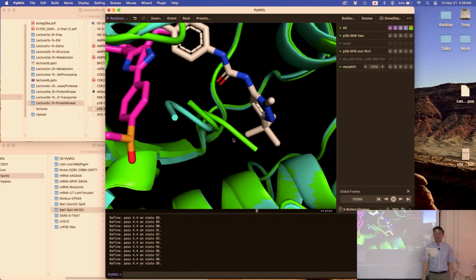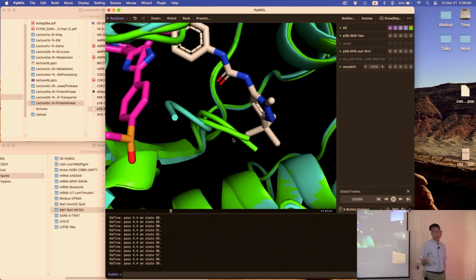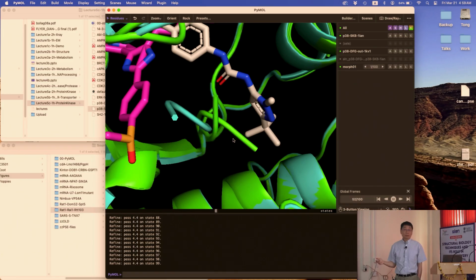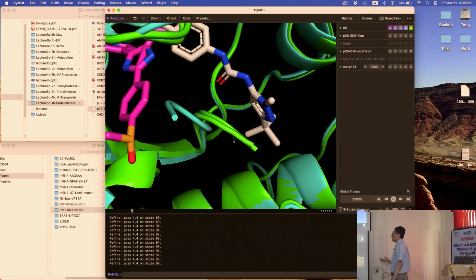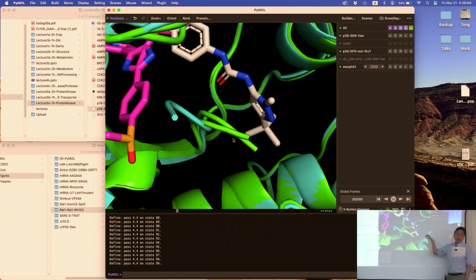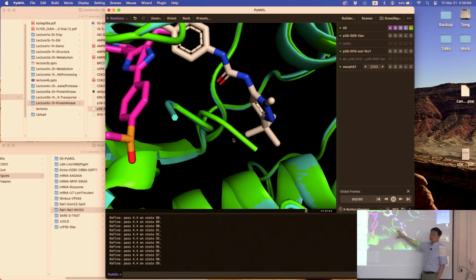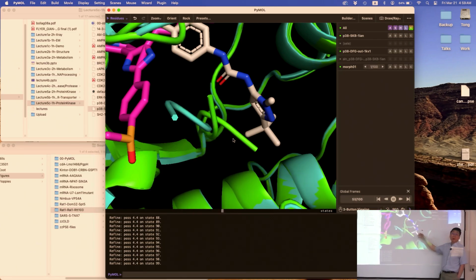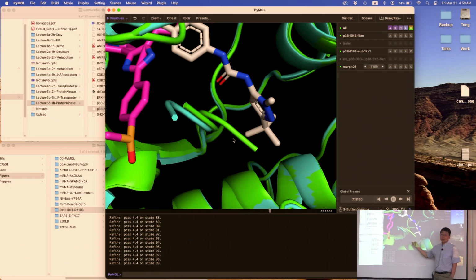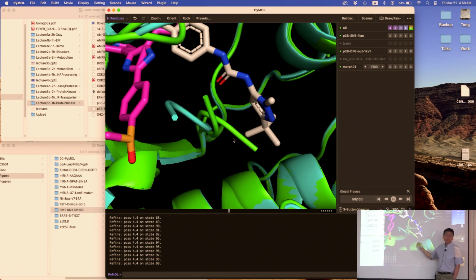Okay? Do you sort of see the same thing? Yes? Okay, so far I've shown you morphing using only the ribbon or cartoon drawing, but you can be more sophisticated. You can morph side chains as well. Because in this case, we know this is the phenylalanine that goes back and forth. So we'd like to show that phenylalanine side chain, right? That will be even more informative.